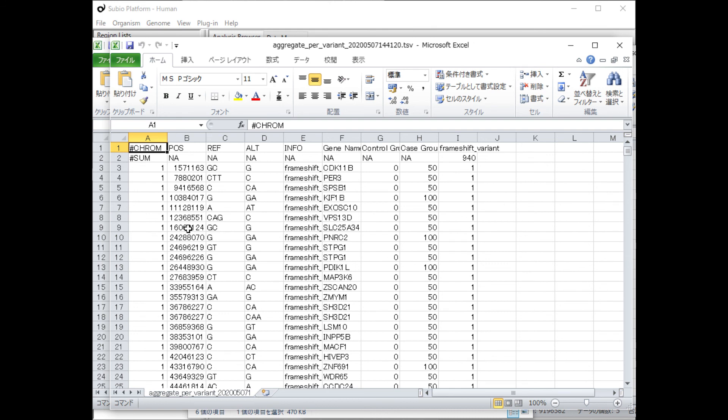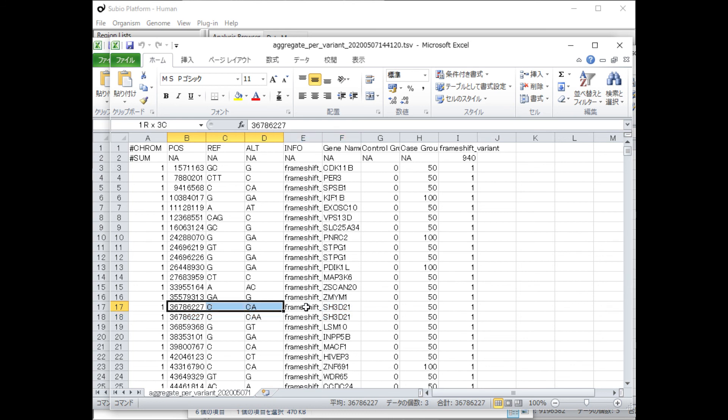This result shows that mutations were detected at the same position on the SH3D21 gene, but there were two types of changes, one with one insertion of A and the other with two insertions.